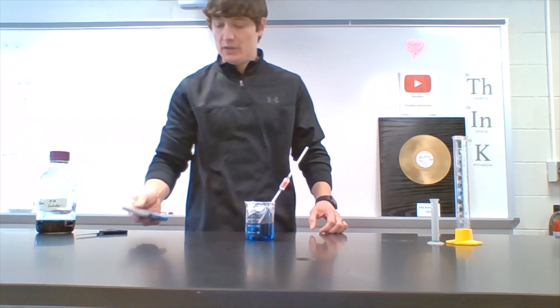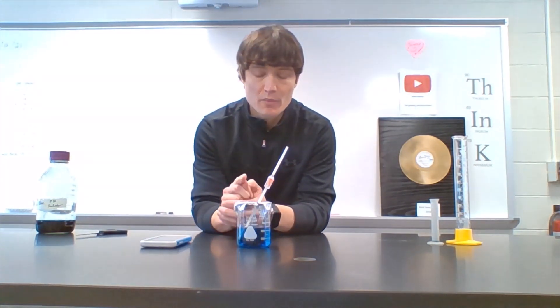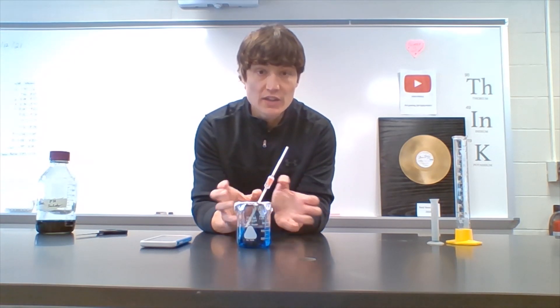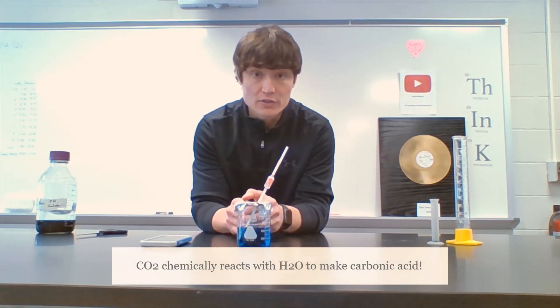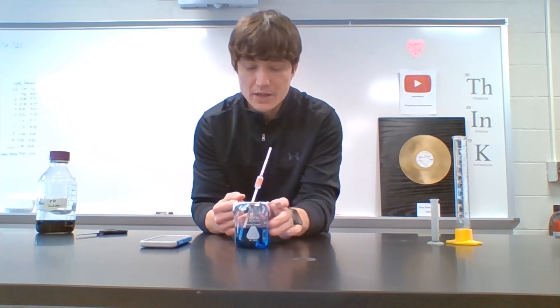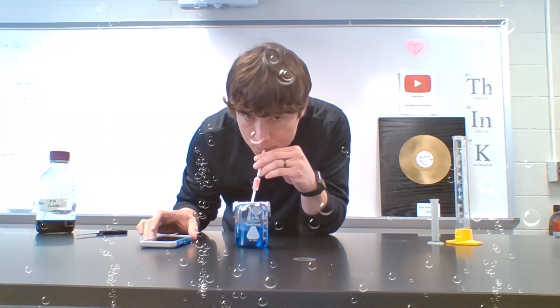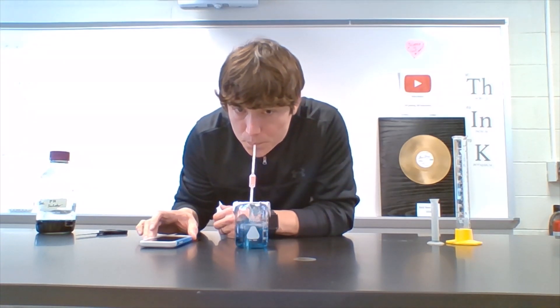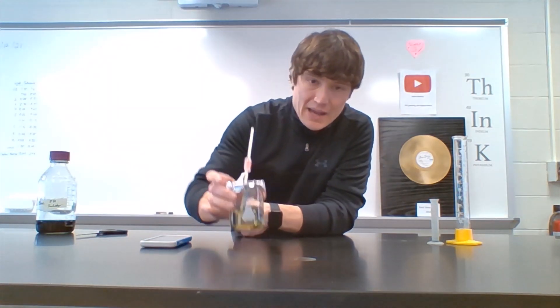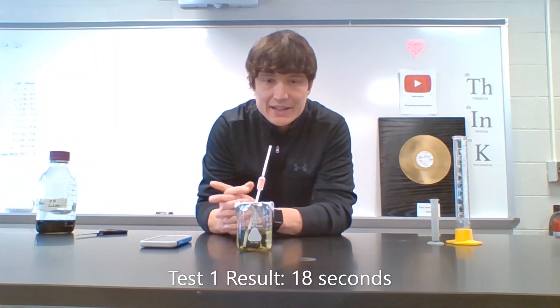Next I'm gonna get a timer on my phone. I'm gonna blow bubbles into the beaker and stop the timer when my pH indicator changes color. This is gonna indicate that I have turned the liquid in this beaker into carbonic acid by introducing CO2 into the water. And as you can see, my liquid has turned to a light greenish color and it took about 18 seconds for that change to happen.